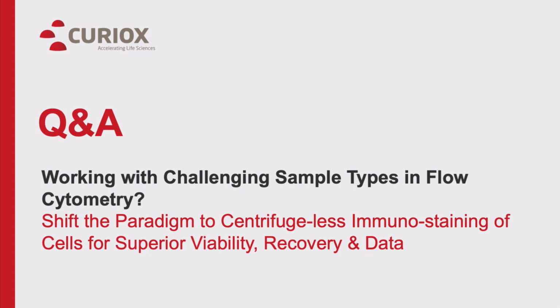Next question, can the laminar wash plates process incubations at different temperatures? Yeah, on the auto system they can. Great.